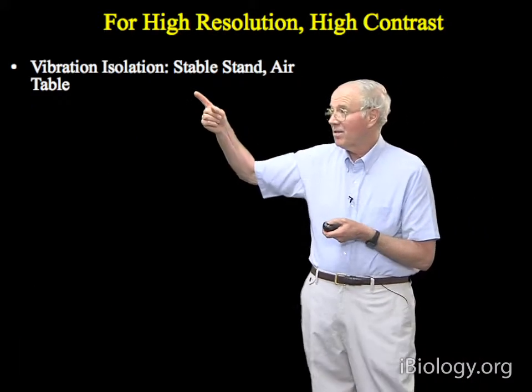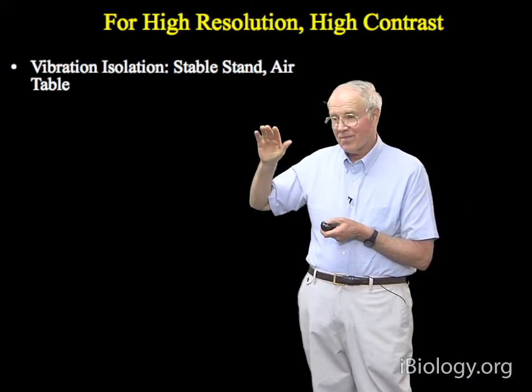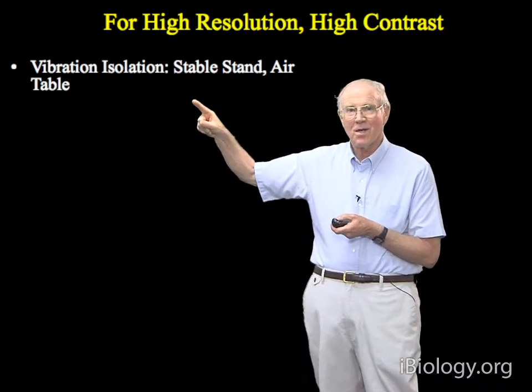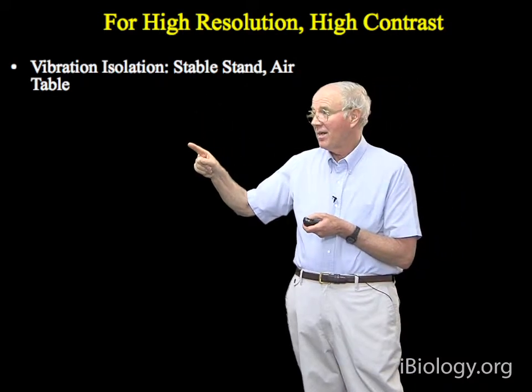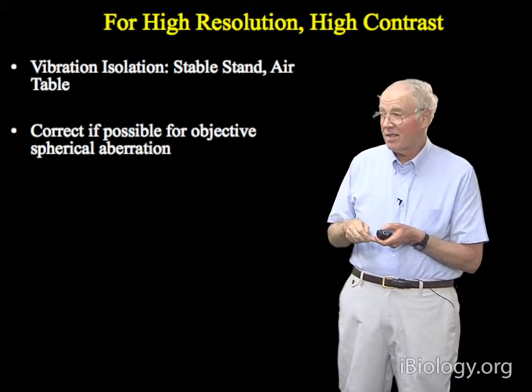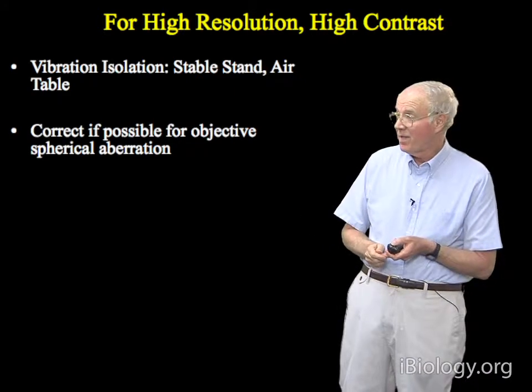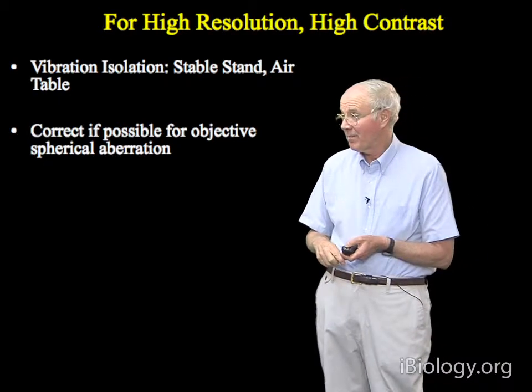If you're going to do high resolution, you have to have vibration isolation. So if you can hit the wall or the floor around you and your image disappears on you, then you know that you've got vibration problems and you won't be able to see the highest resolution. All right? You need to correct if possible for spherical aberration, and so if you're working with microtubules close to the cover slip surface, the objectives in oil immersion are corrected for that. If you're going deep into water, then you have to use water immersion to deal with that.